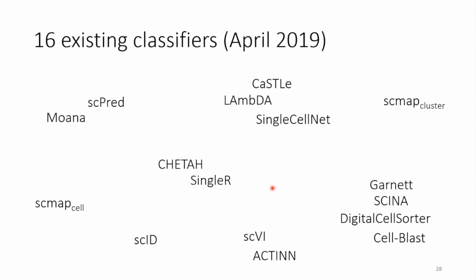Seurat is again using a lazy classifier. So there's actually no classification, there's no training on the data. You have your reference map, you do integration. I believe you covered the integration already in the course. So you do the integration, then you have the query and the reference in the same place. And then they use a weighted classifier like we explained here.